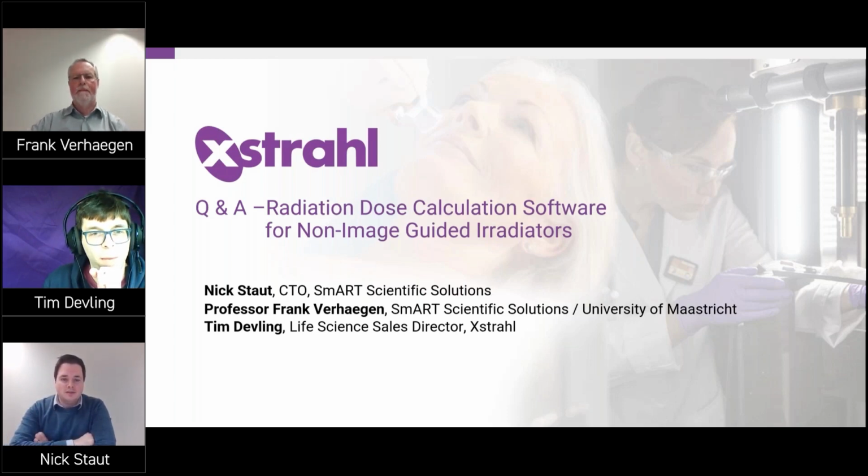Yeah, in this example, I had the cells as soft tissue, then a layer of water above it, and then the plate was PMMA. But you can change those materials. I think there's around 18 or 20 different materials, but it's relatively easy to extend that as we get user feedback.